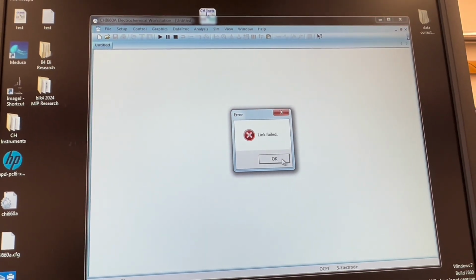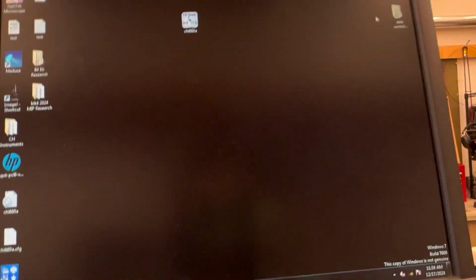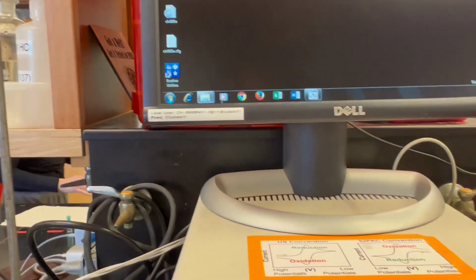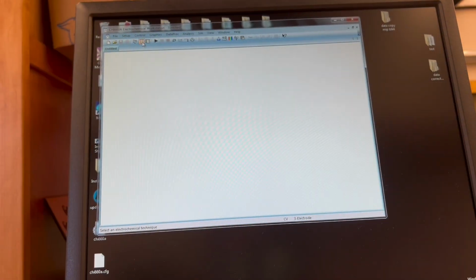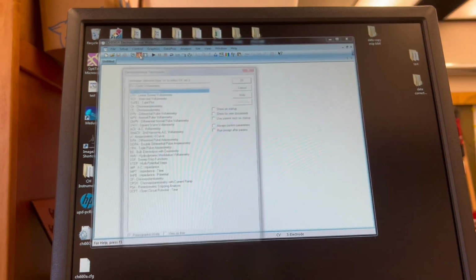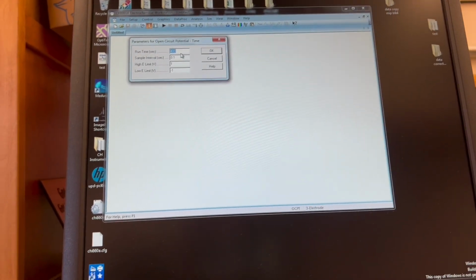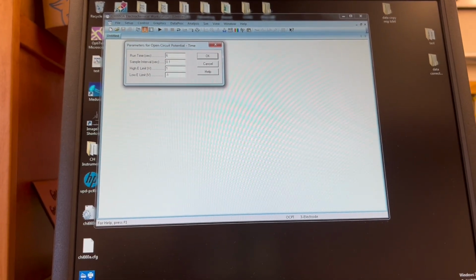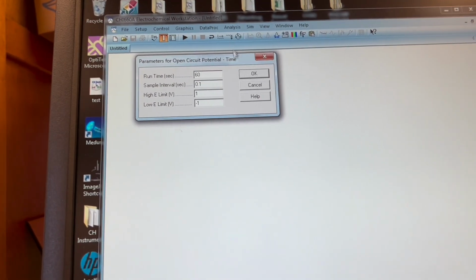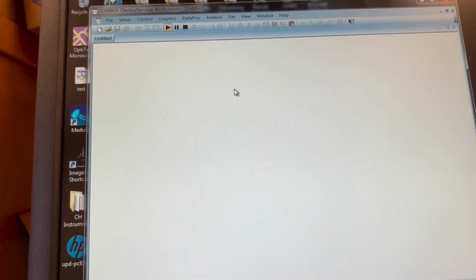This could happen, but it's not a big problem. We could restart our computer and the instrument, and that could help us solve the problem. And then I just restarted and chose OCPT and clicked OK, gave it 60 seconds, and OK, and let it go.